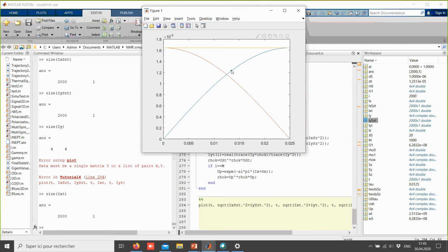Of course, if you stop here, it's not a full analysis of the reason why. Of course, it's better to do it analytically, but for cases where you cannot do analytical calculation, you can follow the terms that are created in your density matrix using this strategy.